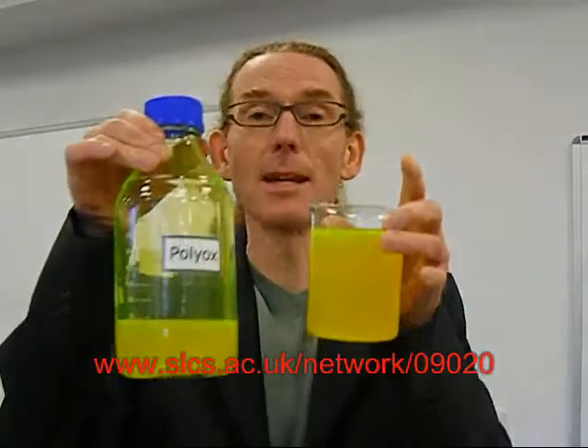Science demonstrations, effective and safe, will allow you to develop the skills and confidence needed to demonstrate the fascinating allotropes of sulphur, the eye-catching burning of sodium and chlorine, or perhaps more simply, the non-Newtonian behaviour of this amazing fluid.